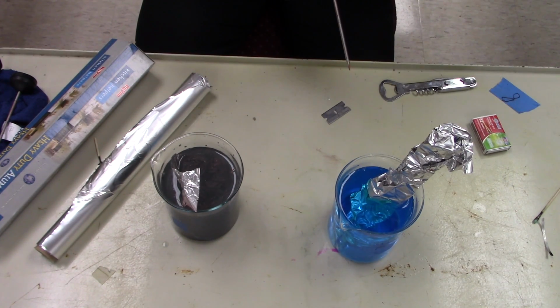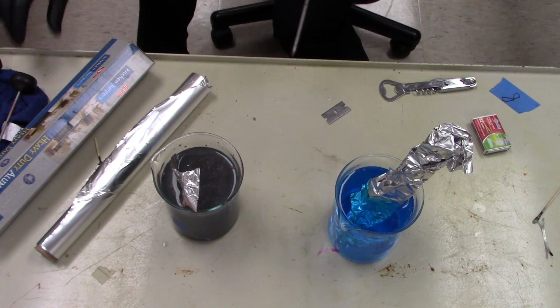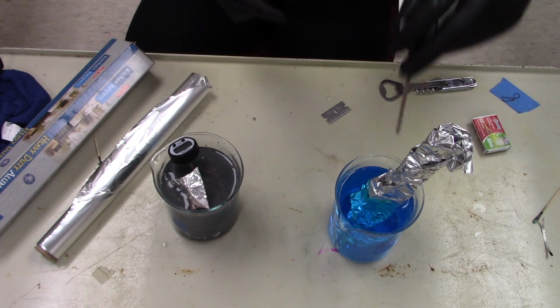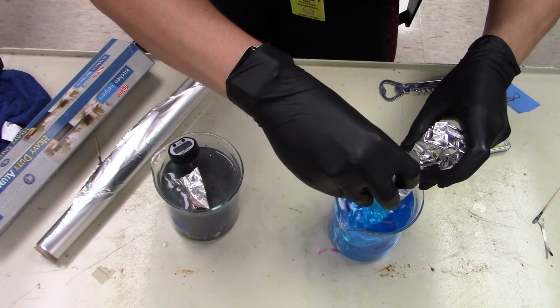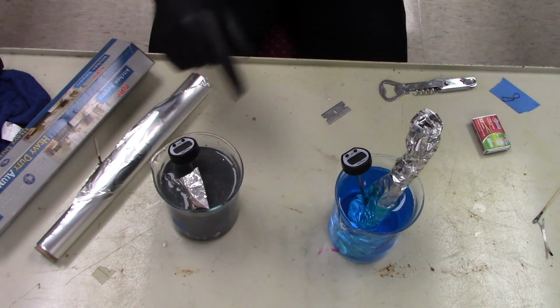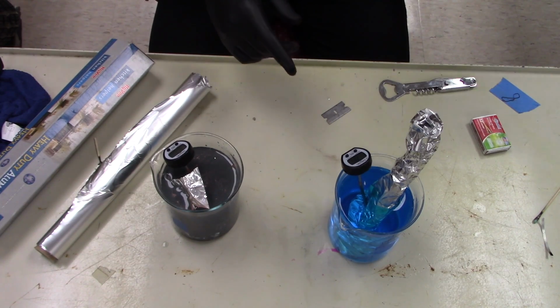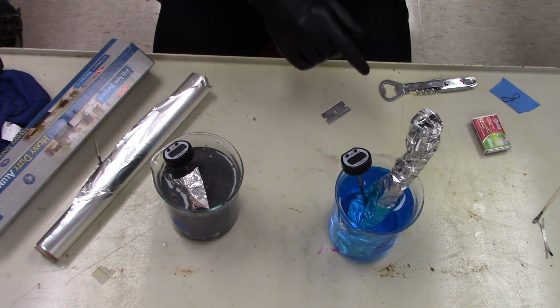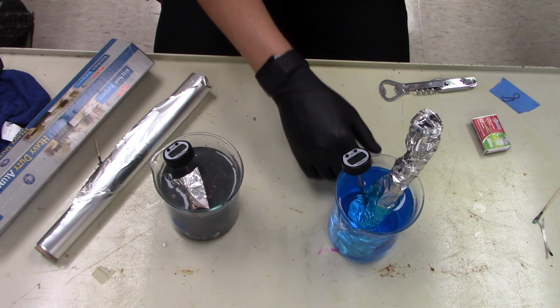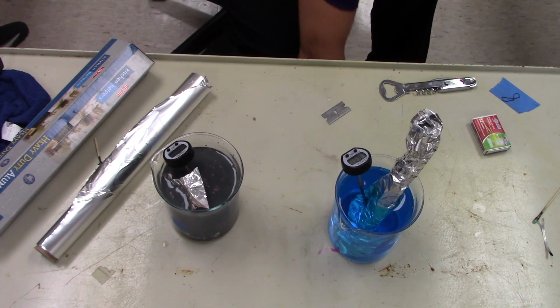And if we check the temperature, where did my thermometer go? Right up there. Oh, thank you. If we check the temperature inside there, it should just be room temperature, which is nothing special. I'm going to put this inside the aluminum. So this one's a little warm because it's been reacting. It's at 87, 88 degrees. This one is just a little over, it's about 82 degrees.